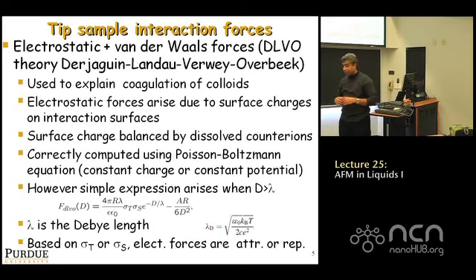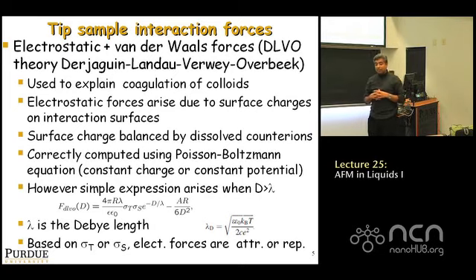positive charge. This effect is even stronger when you put some ions into water, when you have an ionic solution of water, because now you have free ions, sodium ions, potassium ions, that will do that for you. If you have a negatively charged surface, the ions will simply migrate and start assembling, in a sense shielding the charge that you have. So the point is, this effect I'm talking about happens in polar media, for example, with water.